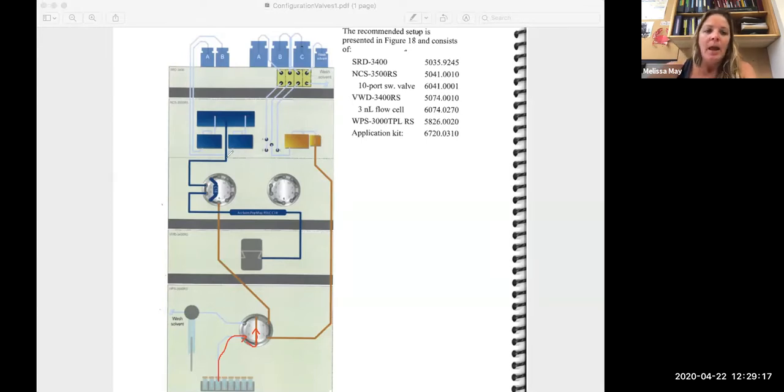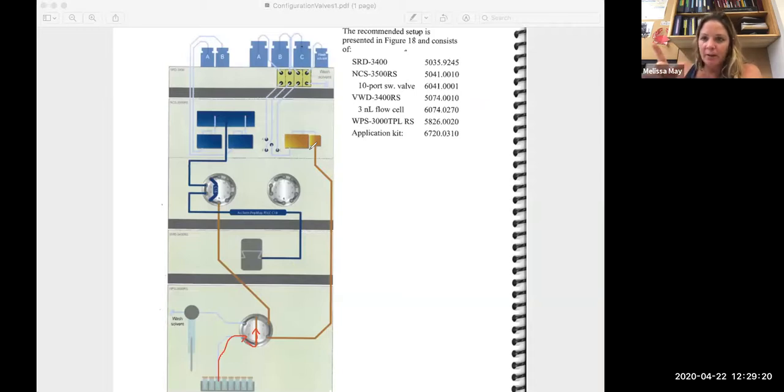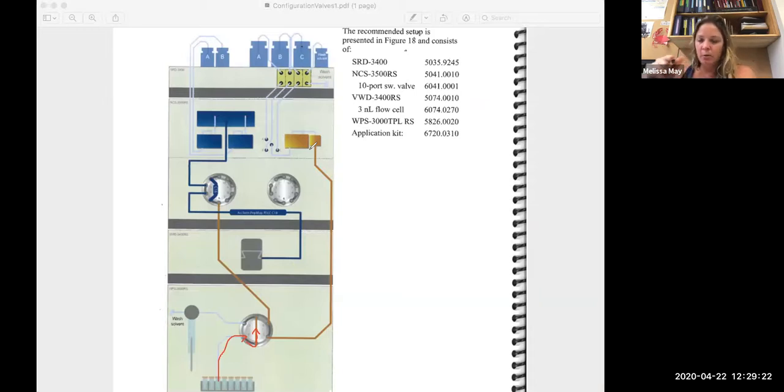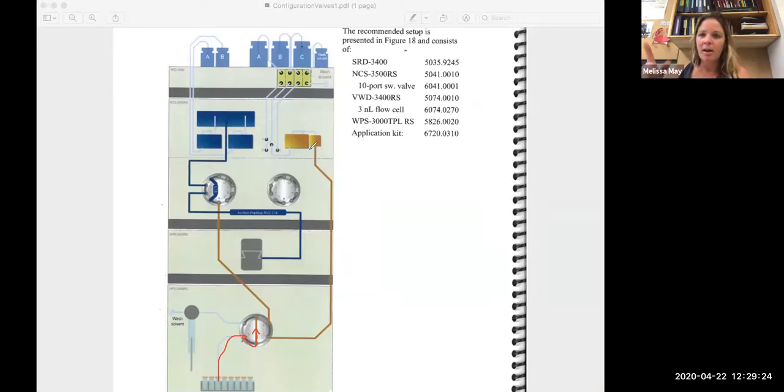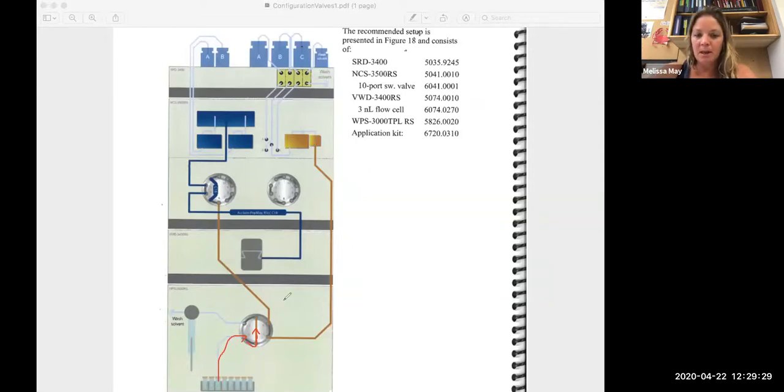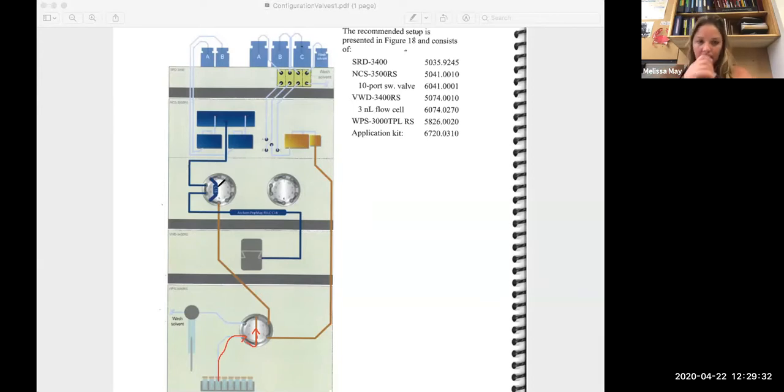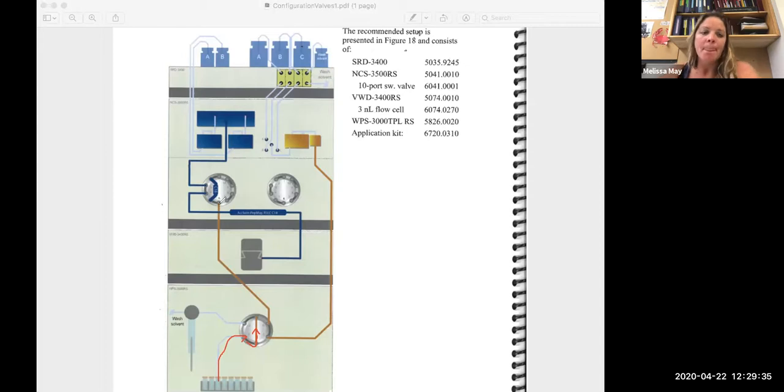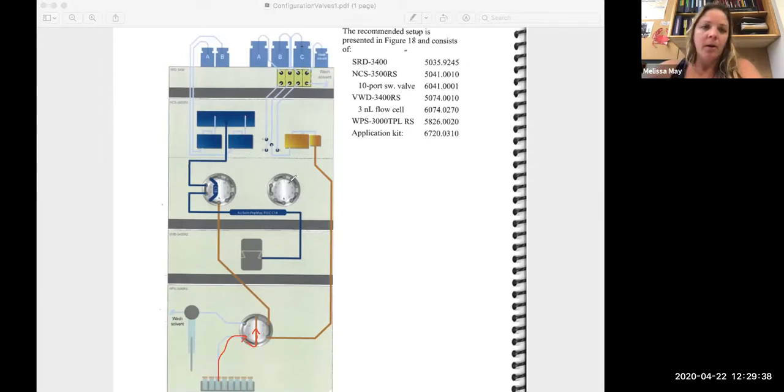And so what's happening as we're loading, which you can calculate the time based on the flow rate and the distance of your tubing of how long this is going to take to actually load your sample from here onto your column, or at least onto your trap column, by just doing some simple math.